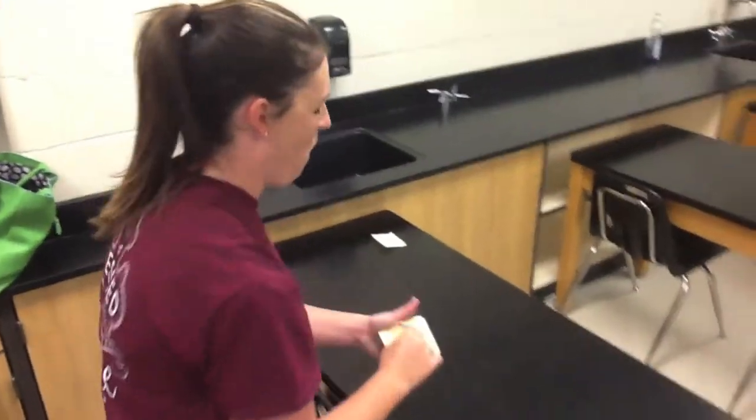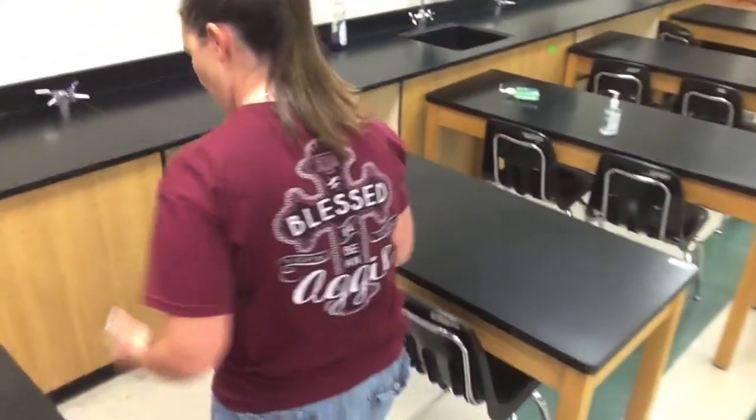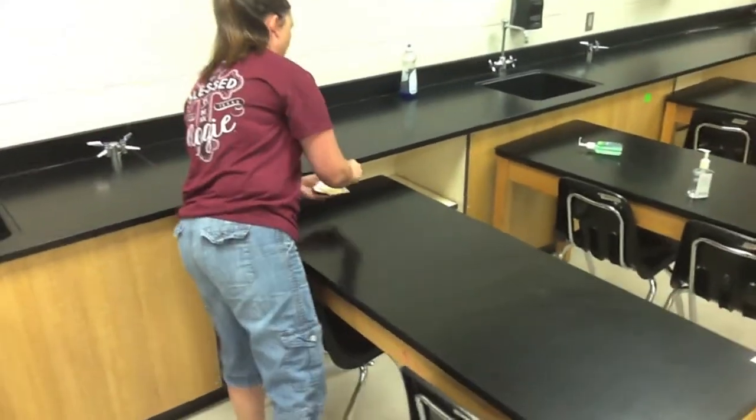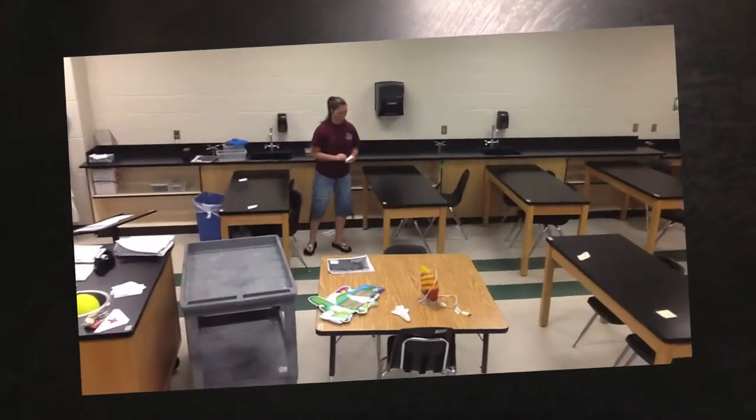We used an alphabetical system in order to make the process move smoothly. First, label each area with an alphabetical letter as shown. Make sure to leave extra room for letters C, B, and S because they tend to have lots of items.